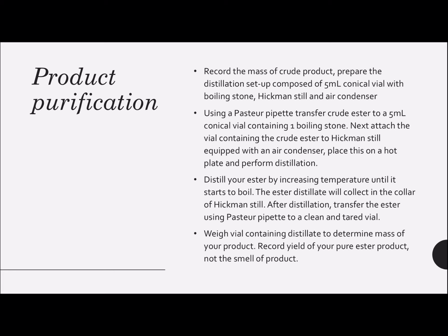Moving on to the product purification step, we're using Pasteur pipettes to transfer crude ester into a vial. We're distilling this to further purify it. This ester distillate will collect in a Hickman still, right? After this distillation, we transfer the ester using Pasteur pipettes to a clean, tared vial. There is also anhydrous sodium sulfate, which is really just to remove excess water from the solution. So it's basically acting as a drying agent, right?